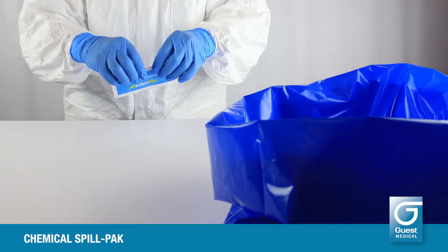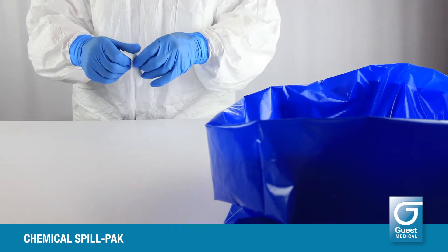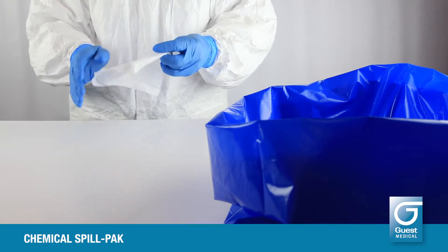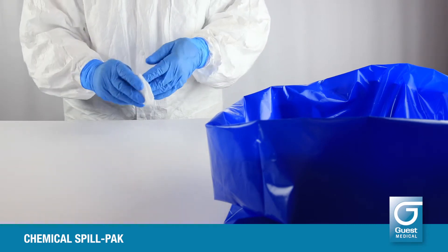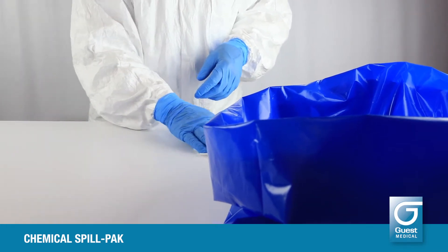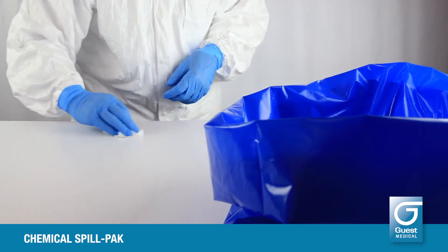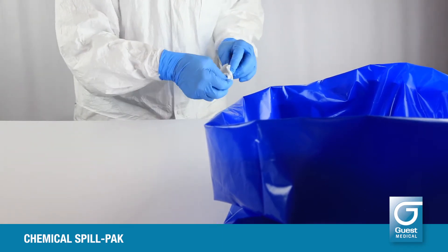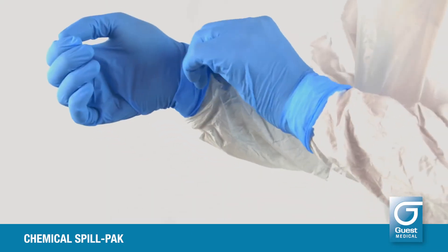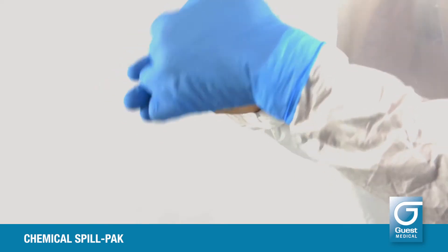When the area of the spill is dry, use the detergent surface wipe to clean it. Discard the used detergent wipe into the waste bag. Remove all your PPE, gloves last, and discard all into the hazardous waste bag.